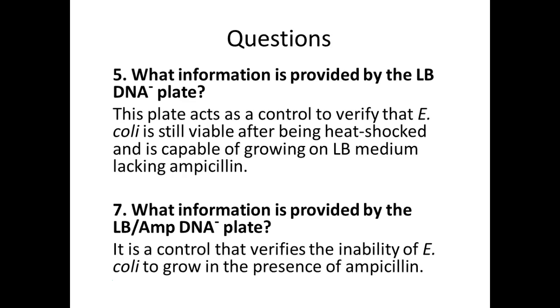So my ampicillin's working too. I'm happy about that. It's usually an issue. Successfully killed bacteria with ampicillin this week. This always makes me happy.